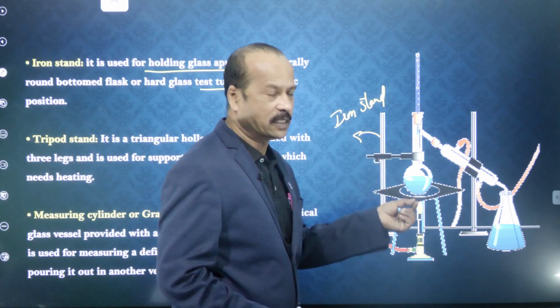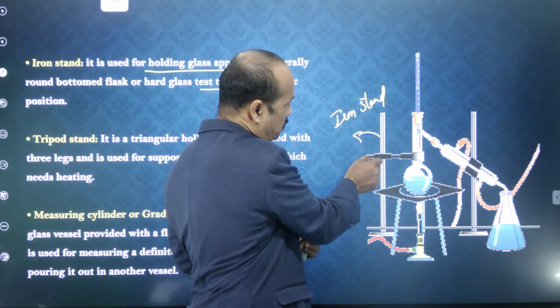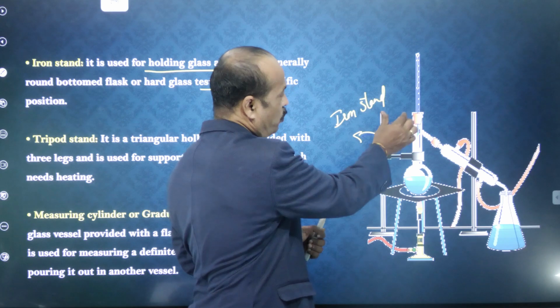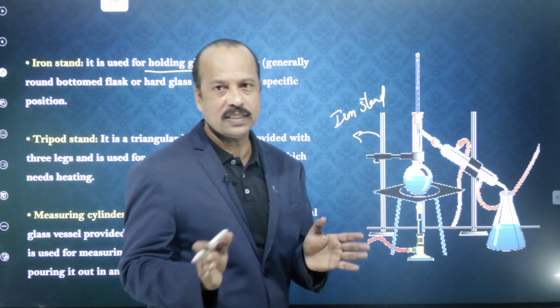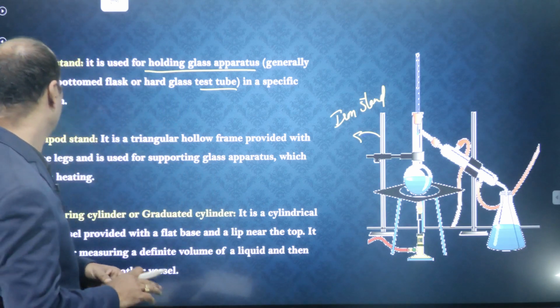Wherever we want to, we can adjust it. So, if you want to move it upside, you can just loosen it and move it. So, I can fix it anywhere according to the required position. So, that is the version.